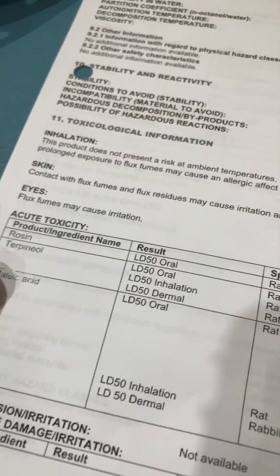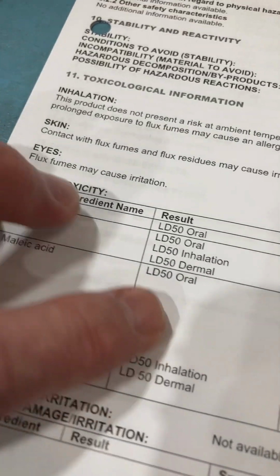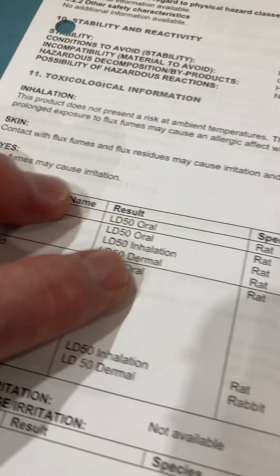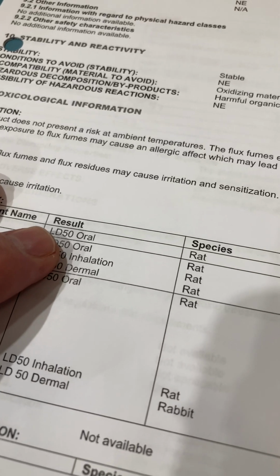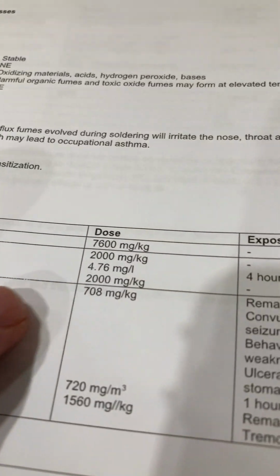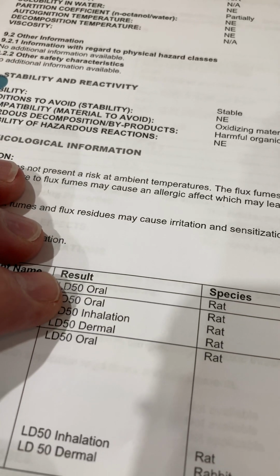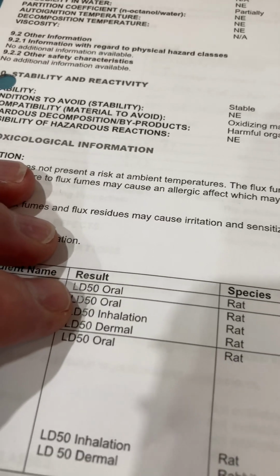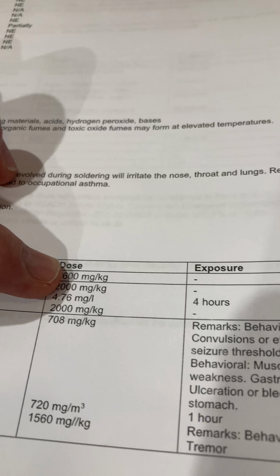So this is very important to note here, where you can see the toxicity levels. What this means is that LD50 means that if it is ingested, the lethal dose 50, what it takes to kill 50% of the population is this amount of chemical in that amount of time.